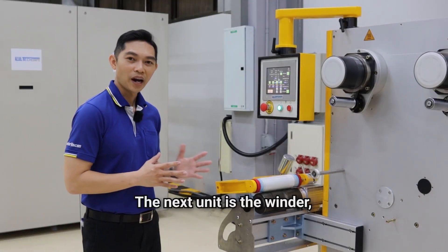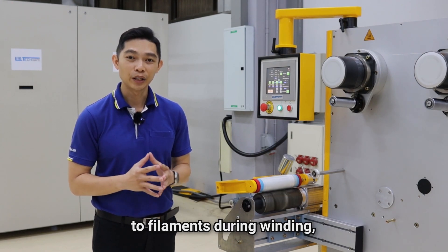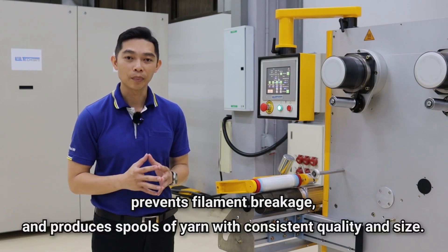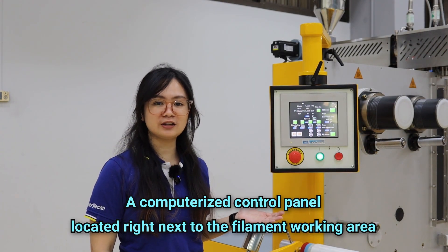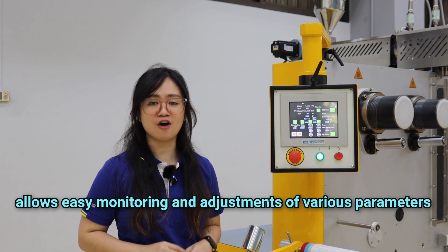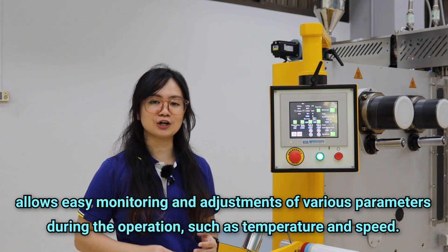The next unit is the winder, which provides stable and uniform tension to the filament during winding, prevents filament breakage, and produces the spool of yarns with consistent quality and size. A computerized control panel located right next to the filament working area allows easy monitoring and adjustments of various parameters during the operation, such as temperature and speed.